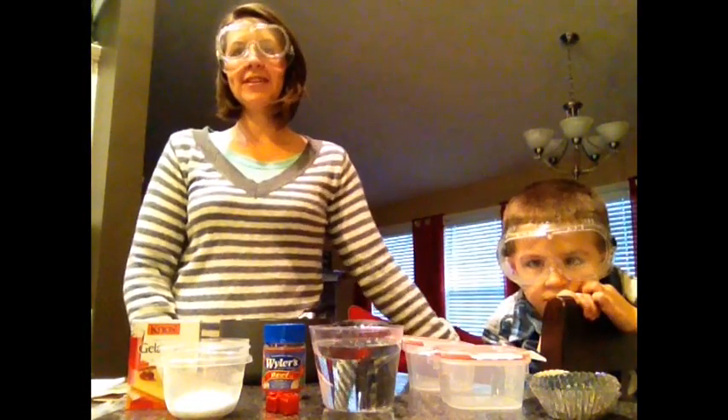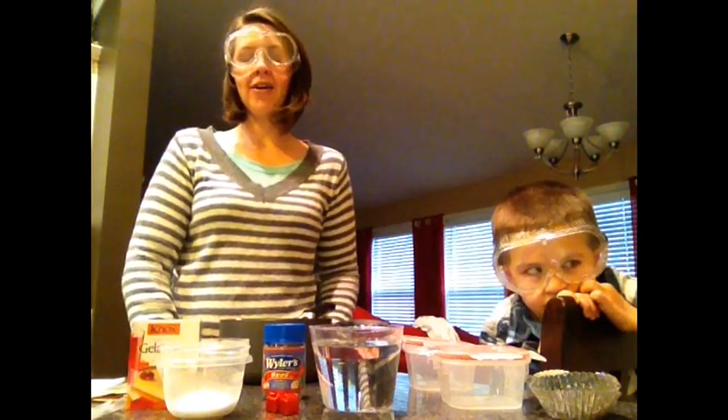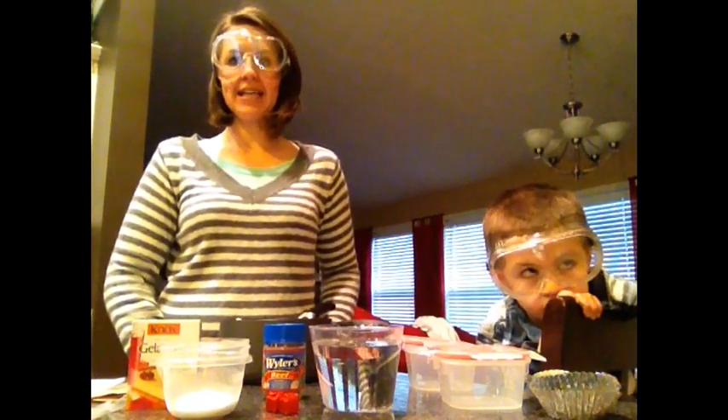Hello, I'm here with my wonderful assistant Kat and we are going to show you how to make homemade agar today so that you can grow some nice bacteria.